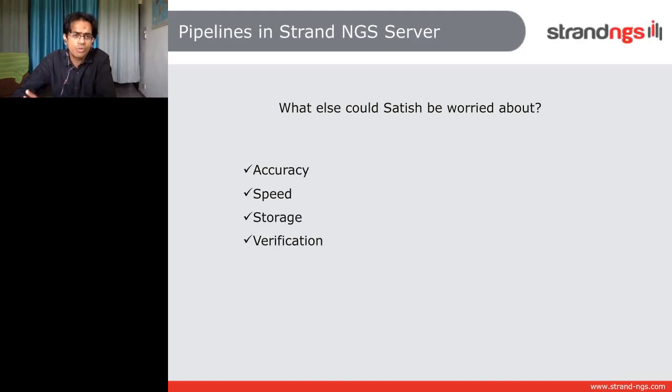And then you also want to be able to verify your data once you get it. It's not just sufficient to say that something is accurate. You also have to be able to visually sometimes go back and look at things, right? So these are the 4 things that he could potentially be worried about. So let's just look at them one by one.